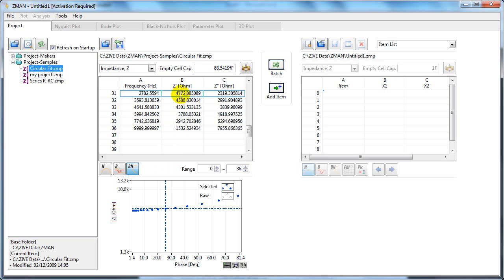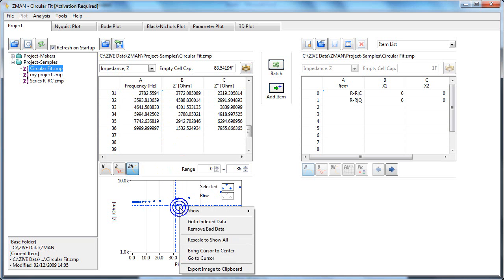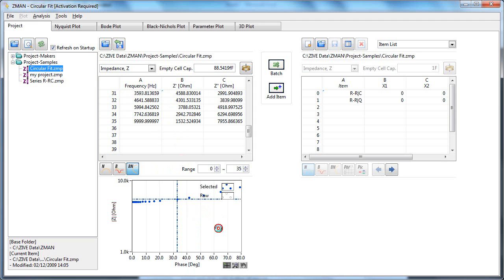For example, if I make a change to 3000, you can see I have moved that data point now. If you want to remove, for example, this bad data point, you can select it and remove the bad data point. You can see it has removed it from there.